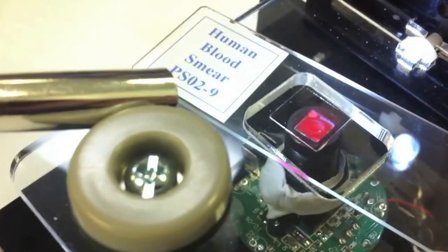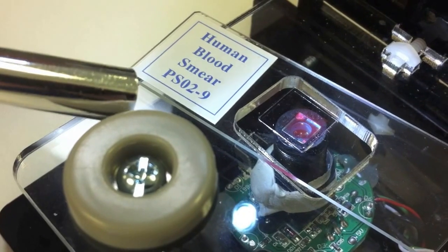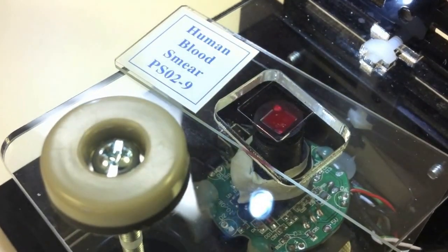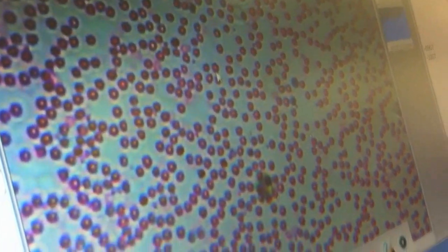That's amazing! Yeah, so with polarization filters there could be more experimenting done. But I can look at these pre-prepared blood samples and see the blood cells. That's not a bad shot.